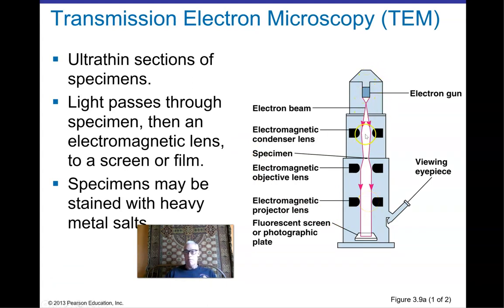We have an electron beam and we have some electromagnets, coils of wire wrapped around the place where the beam of electrons is going to pass down through. Electrons will pass through the specimen at some point in their travel, be focused some more, and they will strike a phosphor, a plate full of material that will be illuminated when the electrons strike them. And we can get an image that's reminiscent of our specimen on the stage there.